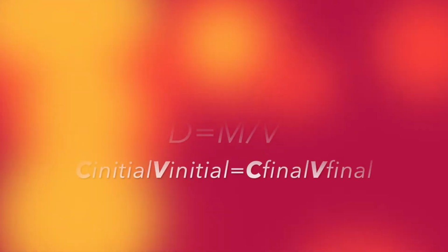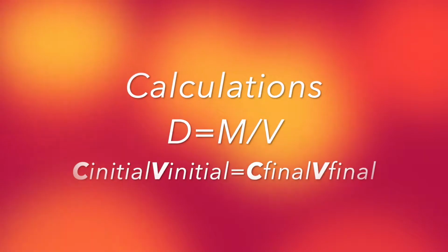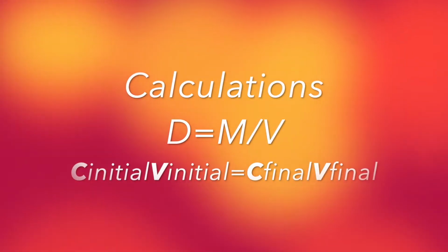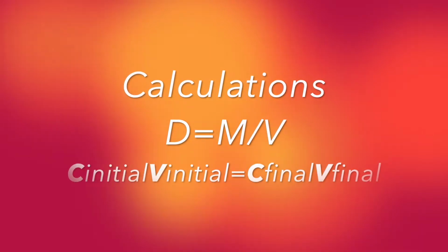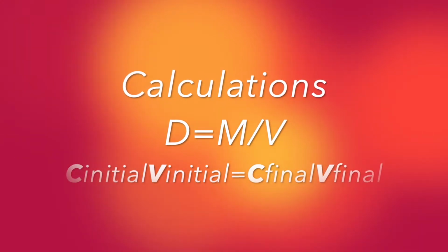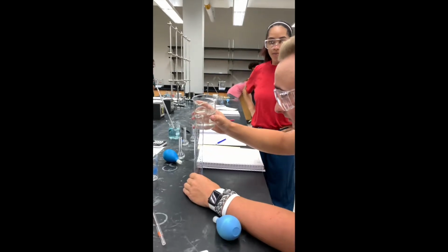Before beginning this lab, you must know that the way to find density is by using the formula density equals mass divided by volume. And when making the dilutions, use the concentration formula. Initial concentration times initial volume equals final concentration times final volume. You will use this to figure out how much water you would like to mix with the stock solution to dilute it. You also need to know how to find the volume of your solutions and dilutions.